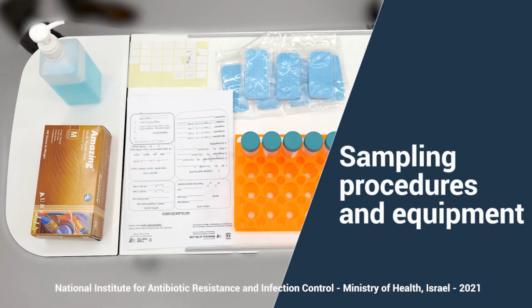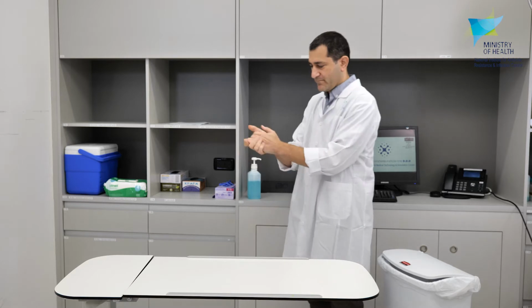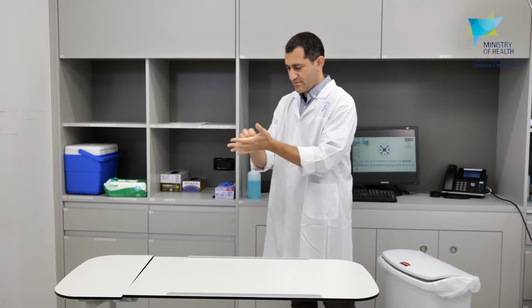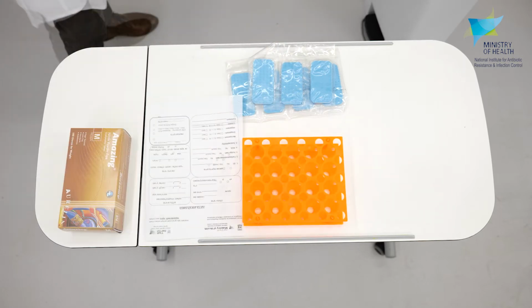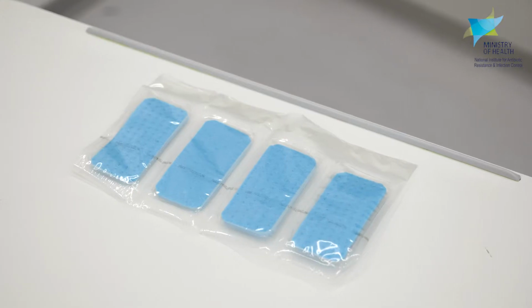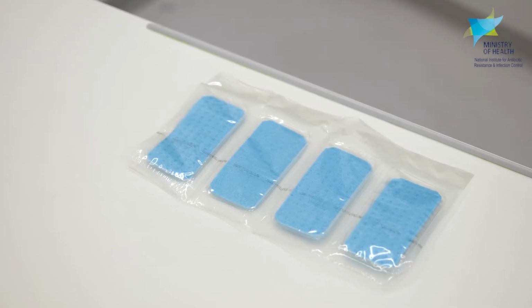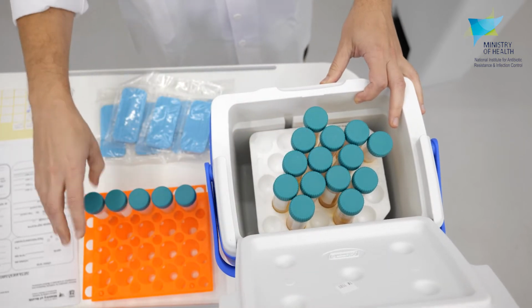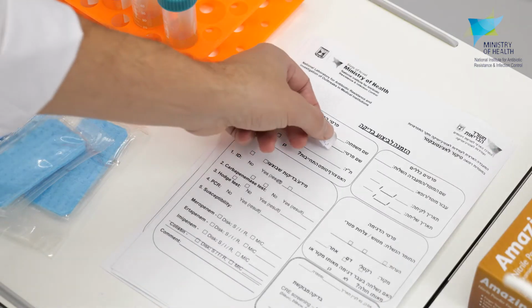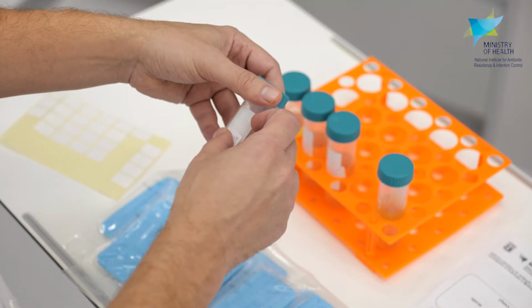Sampling procedures and equipment. Prepare all the necessary equipment according to the sampling plan and place it on a disinfected work surface. We will use a sterile sponge swab containing a buffer that neutralizes disinfectants and antibiotics, and sterile conical test tubes containing 30 milliliters of enrichment broth for incubation. These serve to increase the sensitivity of the screening tests.